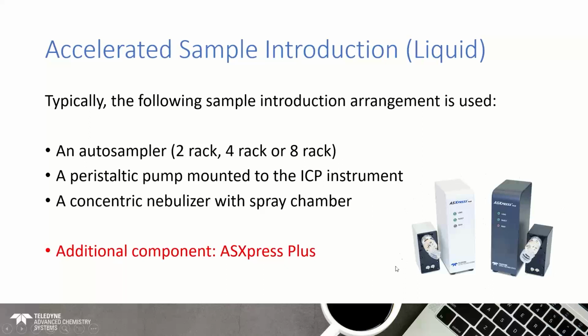Now, there are two versions here. There's the white one, which is for aqueous samples, and there's a dark grey one here, and this is for oil samples. But today we're just going to consider the aqueous samples. So we're going to add this component into the mix.